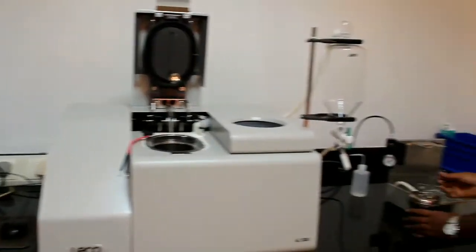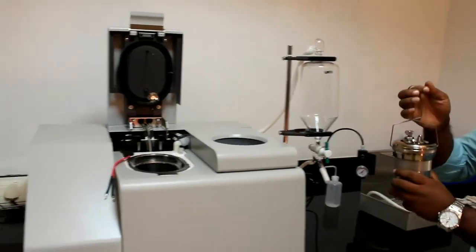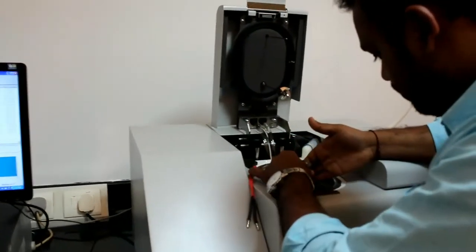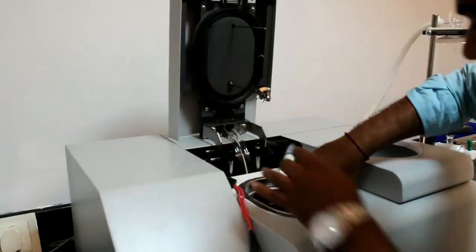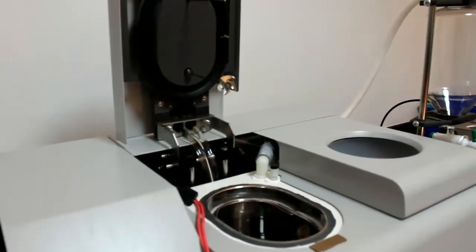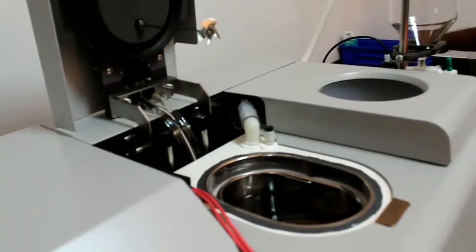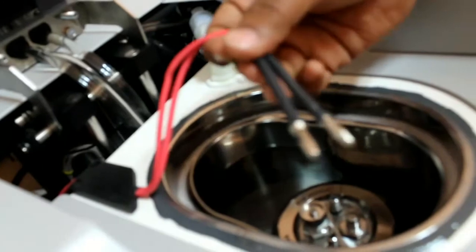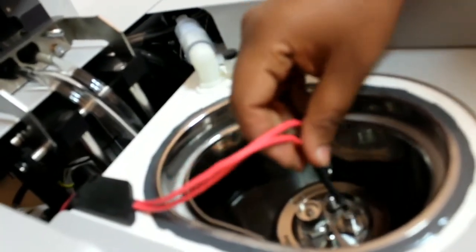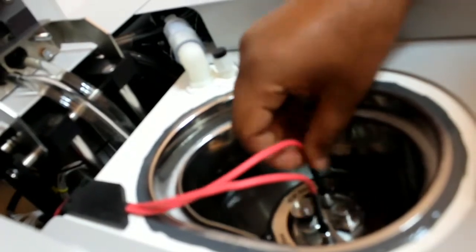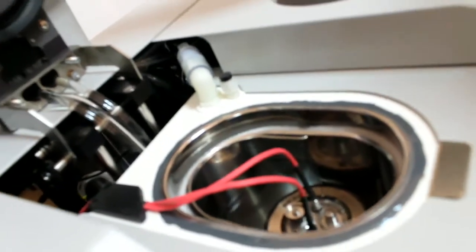Now we will pour the water and we will place the bucket into this jacket. Now we place the combustion vessel. We have a mark inside so that we can easily put our combustion vessel. We have two electrodes which can be connected either side, any other side. Now it is okay. We will close the lid.